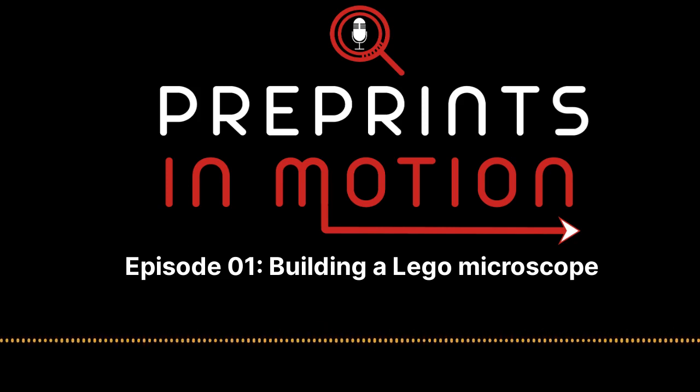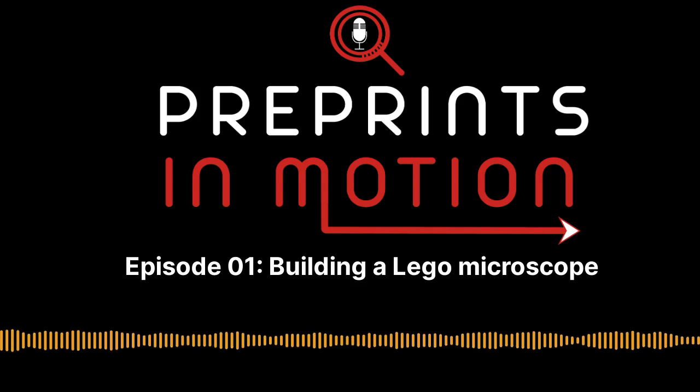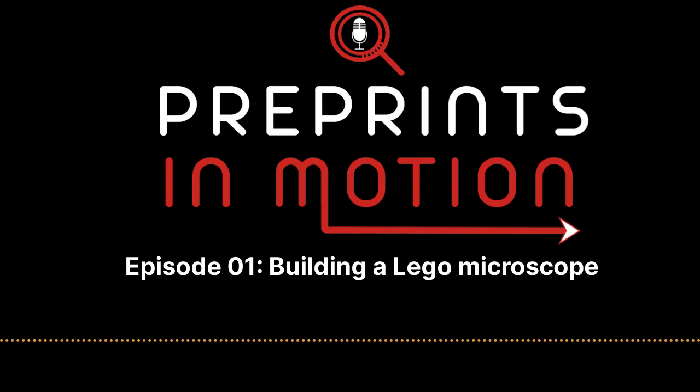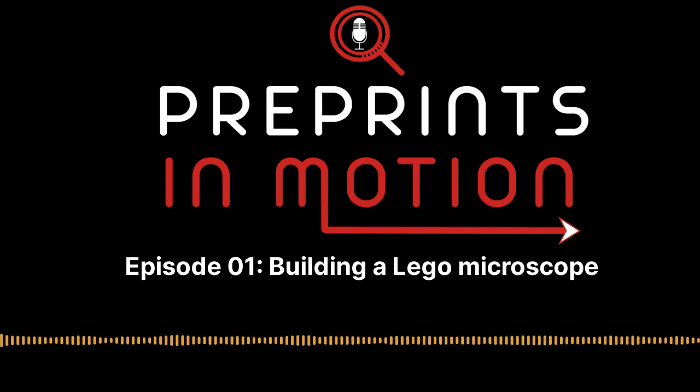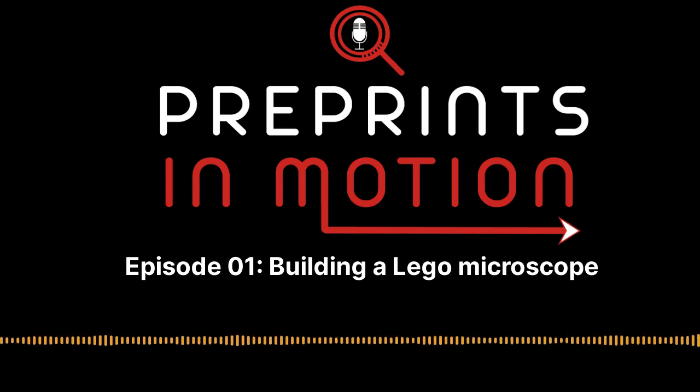microscopy slide goes in. And presumably, it's Lego, so once you've got your main structure, you can kind of play around and make it look however you want, right? Of course, that's something we also emphasized in the preprint. And if you think you have a better design, please share it with us.